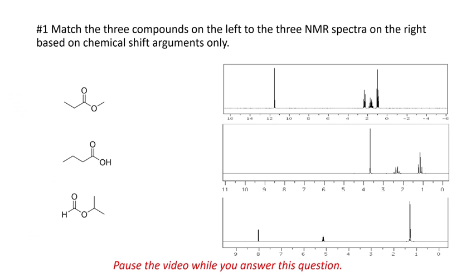Okay, number 1. Match the 3 compounds on the left to the 3 NMR spectra on the right based on chemical shift arguments only. Pause the video while you answer this question.